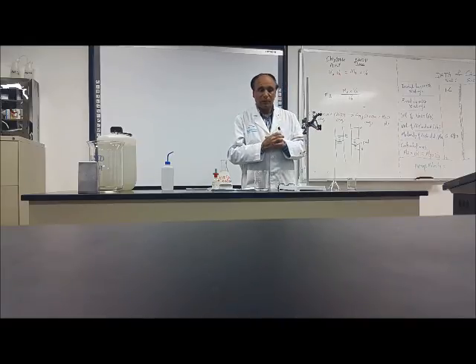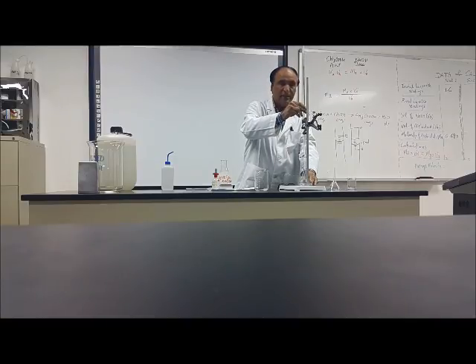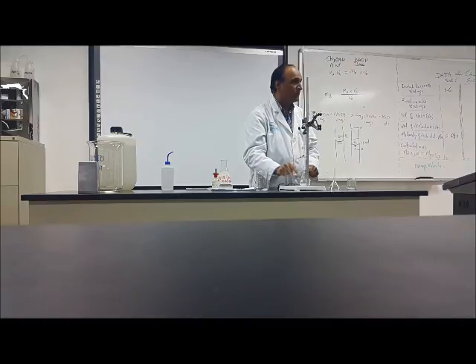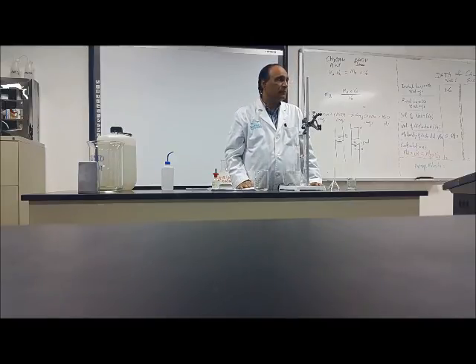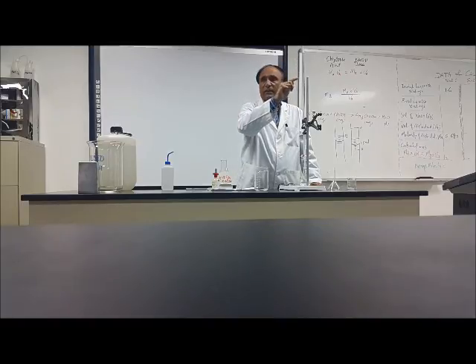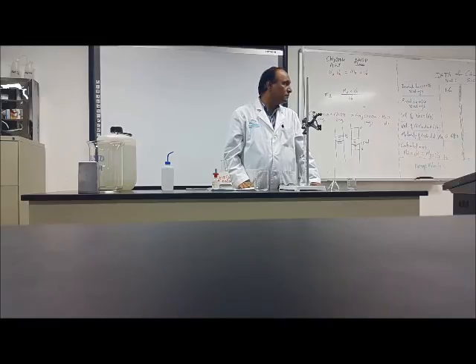Okay, now what I will do, I will put this sodium hydroxide into it. How many milli should I put in that? 1.6 is this one. From here, how much should I put? Maybe 0.4. How much should I put? 5, 10 or what? To be full.